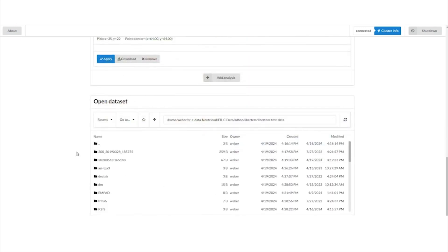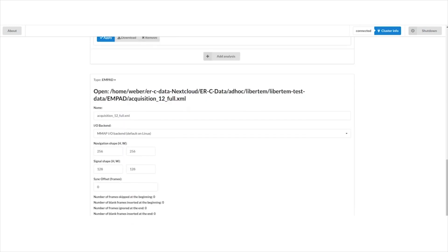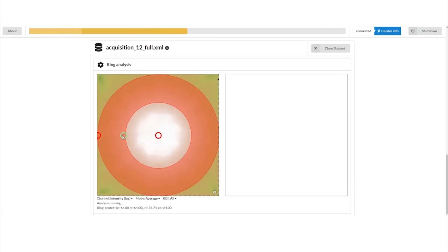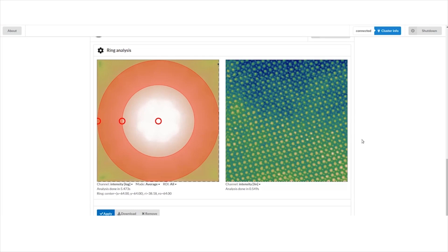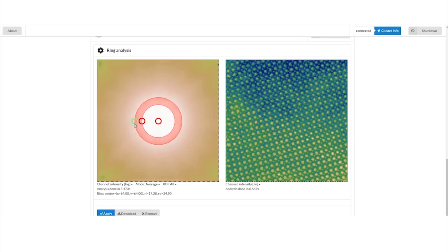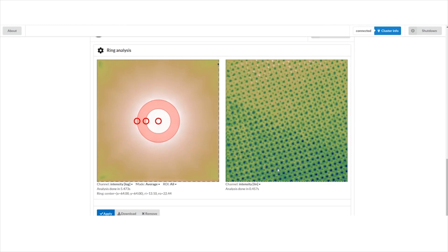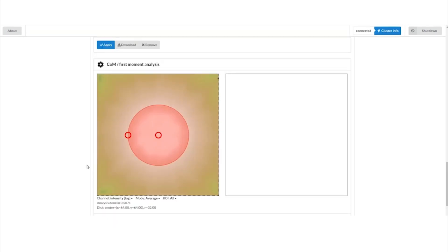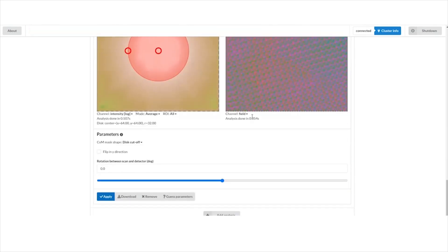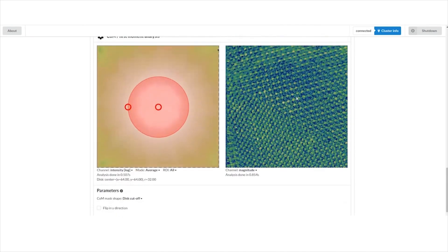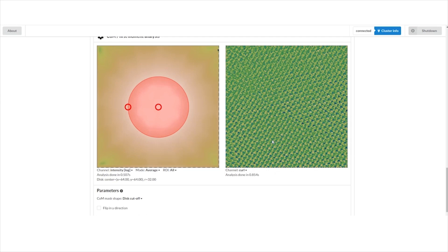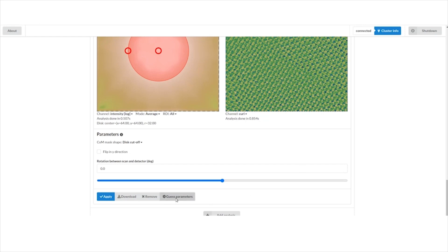Let's open a more conventional 4D STEM dataset. Here in our test data we have an EMPAD dataset on bismuth iron oxide — a high-resolution STEM acquisition. Let's do annular dark field on this one. Half a second — we see a nice crystal lattice. We can also do annular bright field — we get nice contrast and can even see some oxygen. And we can also do center of mass. Looking at the magnitude, we see nice donut shapes of the deflection. We also have divergence and curl — the curl should be flat for a real electrostatic deflection field.